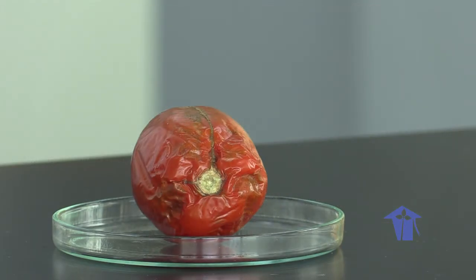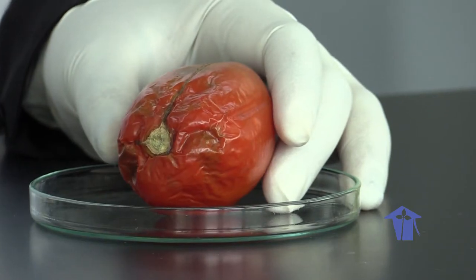In the first part of our lab, we will be looking at understanding the application of the scientific method to Koch's postulates, and we will be isolating the pathogen and looking at its signs and symptoms present on the diseased organism. So here we have our specimen.